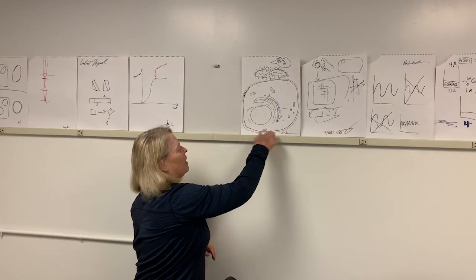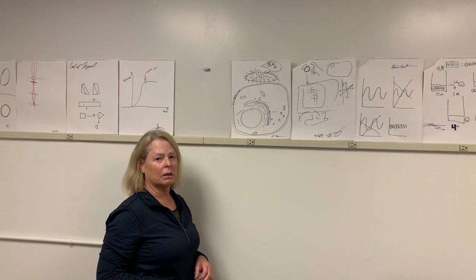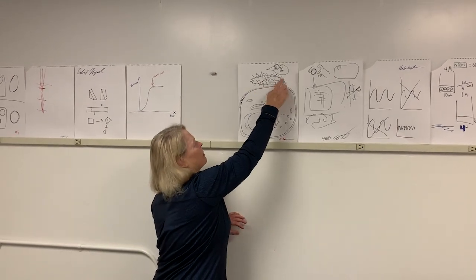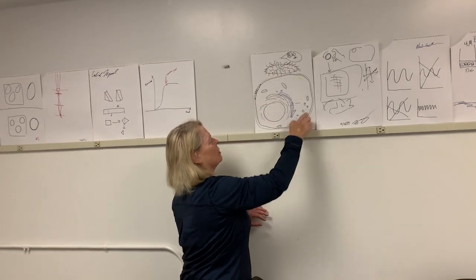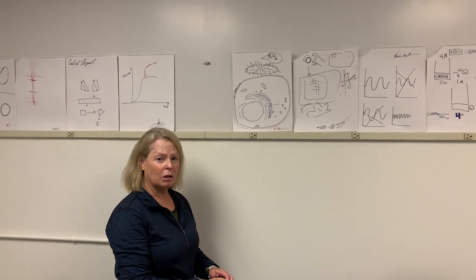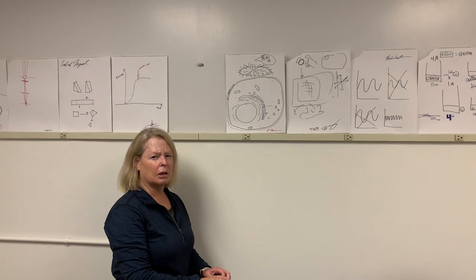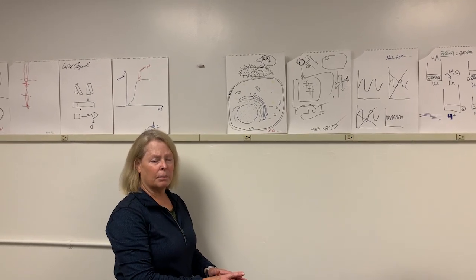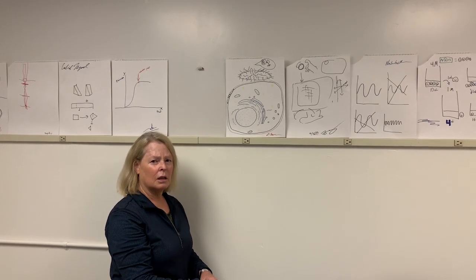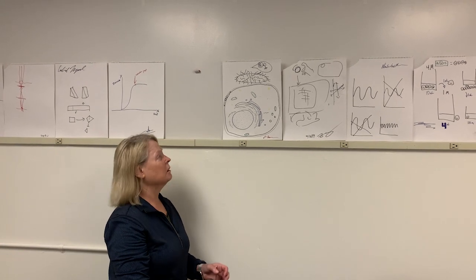So here is a cell. We can see a cell in light microscopy pretty easily. They're big. They seem small, but they're big. Here represents a bacteria in relationship to a whole cell. So you can see it's significantly smaller. You can make out bacteria by light microscopy, but you cannot see the parts of the bacteria. You couldn't see the flagella easily, you couldn't see surface features, so it's very hard to distinguish. So EM is very good for looking at bacteria.